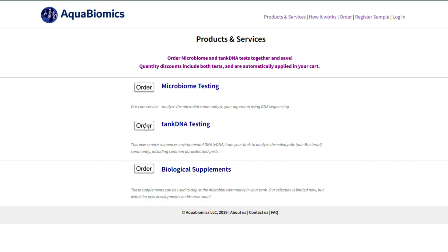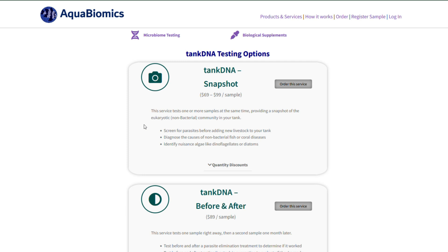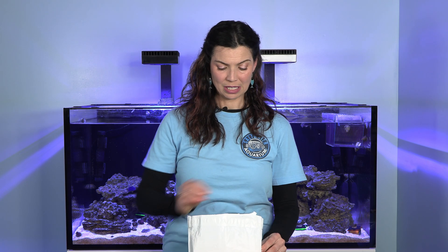After I filled out all of my information online, they sent me a kit. It showed up in a package like this. And when you open it, this is what you get. You get a prepaid shipping envelope and you get the little kit. Up here, this one says M — that's the size gloves that I chose.